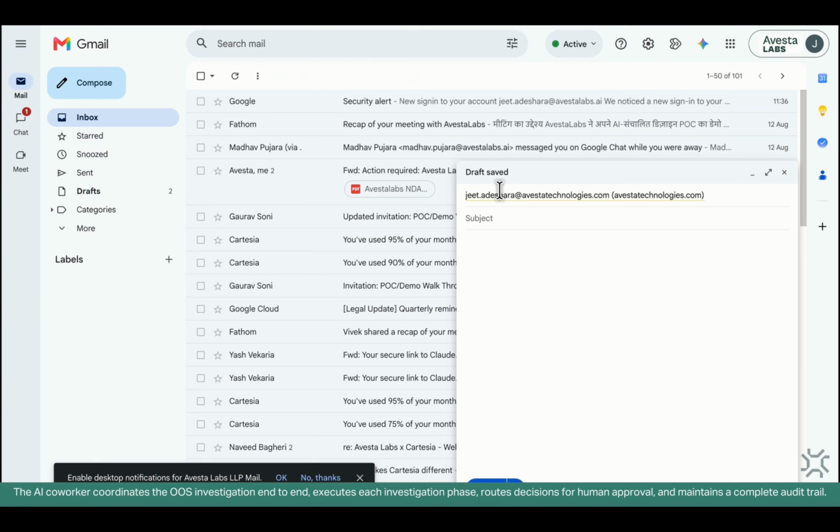So we see an email. This particular event is about ibuprofen 400 milligram drug, and there's a batch number, and the test says that it recorded 88.5% on the assay, whereas the normal range according to the specification was between 90 and 110, and that's what has caused this event, and this is an email that was sent to the quality team.